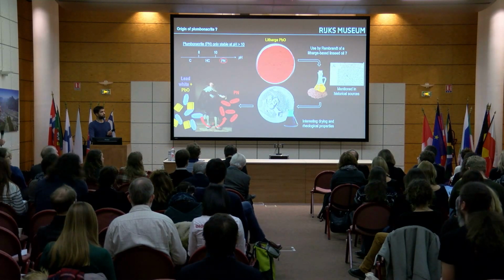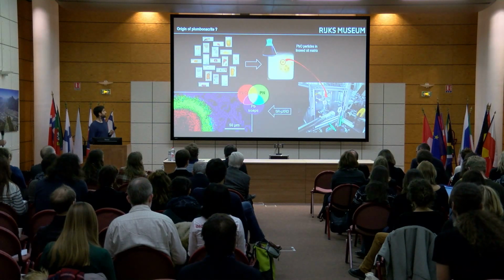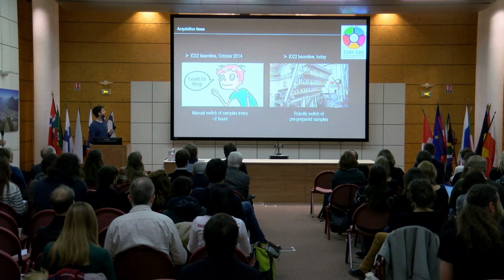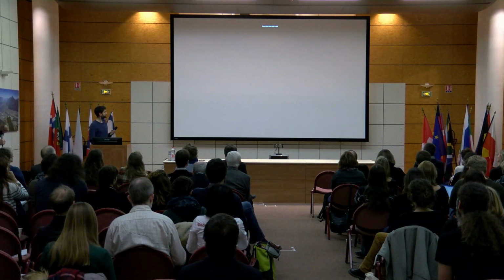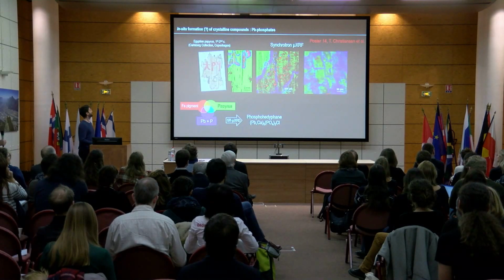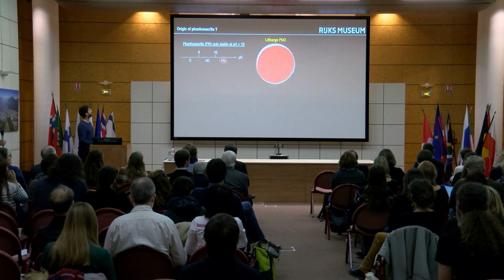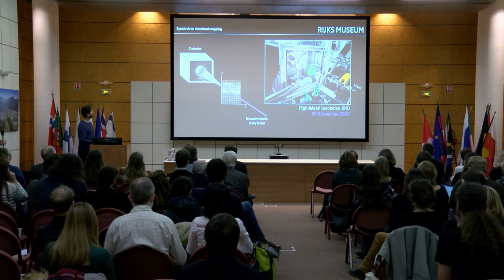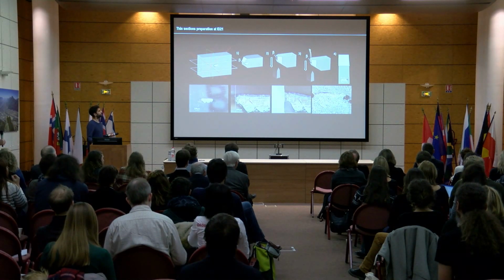If I may, if you can come back to the slide where you explain the preparation of thin sections, since this is my favorite subject, just to make it clear, because the explanation given is for a particular case where the cross sections had been prepared maybe decades ago, and they were coming from a collection of cross sections. So just to explain this particular case where we wanted to prepare thin sections, but years after the preparation of the original cross section.